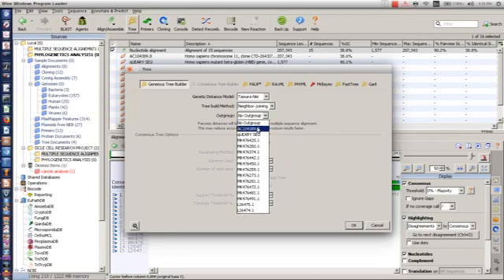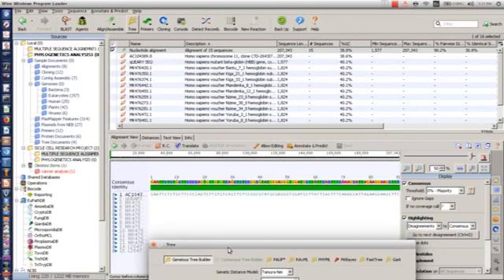So as you can see, we have number one, which is so very long. Now this outgroup, you need to include a sequence that is very far away in similarity from all these sequences, very far. That's why we're picking number one, because it's very different from the others. Whenever you're working on tree phylogenetic analysis, you need to pick an outgroup, a sequence that is very far in similarity from the sequences you're working on. Maybe if you're working on sequences from animals, you can pick a sequence from plants so that it is really far away. The essence is for the Geneious software to be able to come out accurate. So you just pick this one, since it is very very long, the first sequence here. So that's it, and then you click OK.